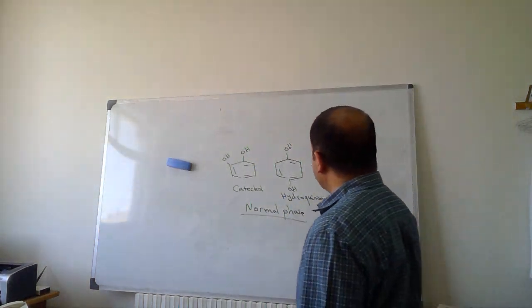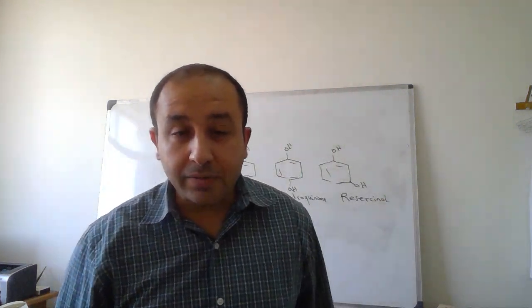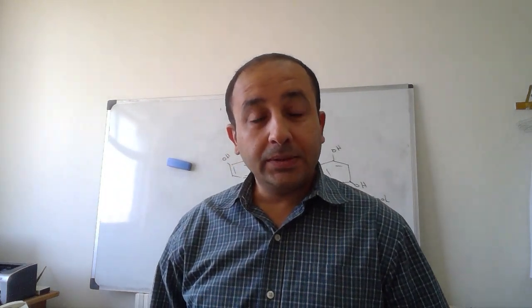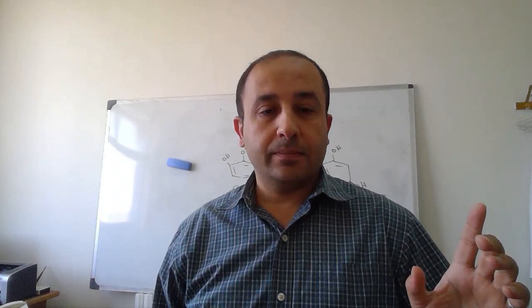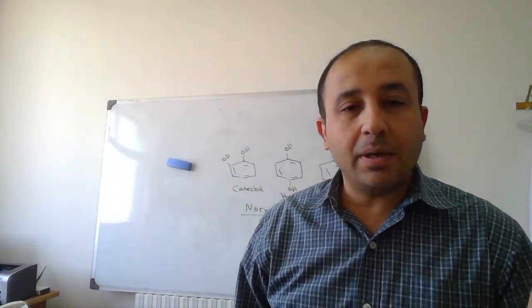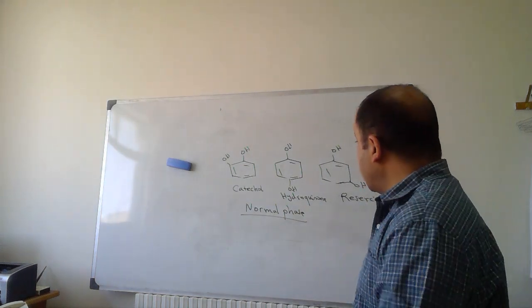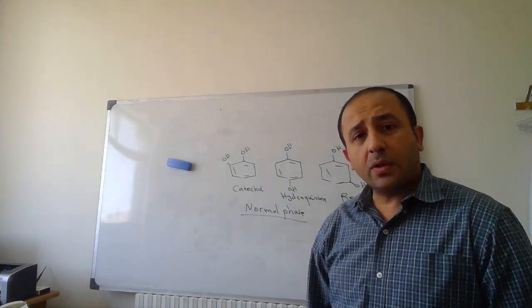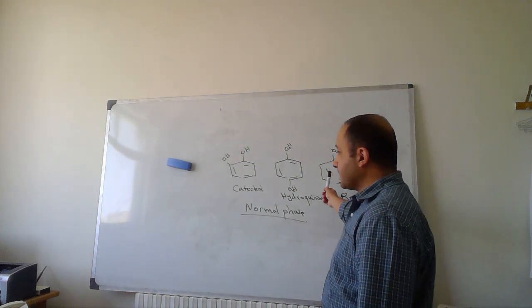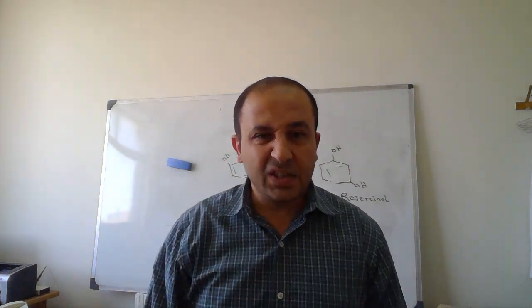Obviously, normal phase silica has the advantage of differentiating these compounds according to their ability to form intermolecular bonds, particularly physical bonds. We are talking just about physical bonds, which are reversible bonds. Now, we can think of size exclusion, but the difference in molecular weight is zero.